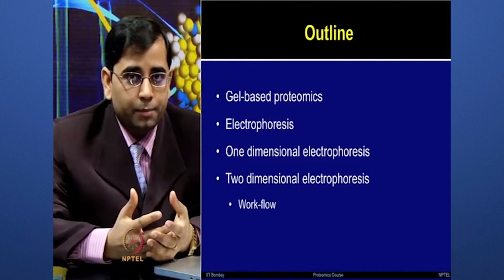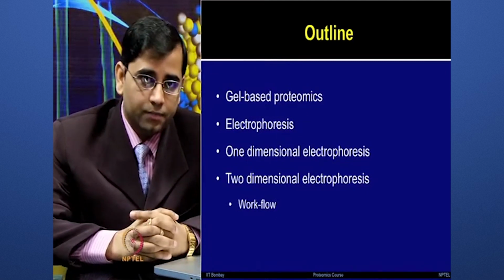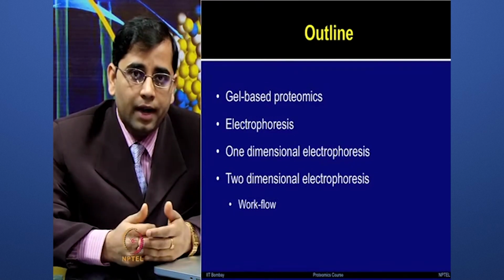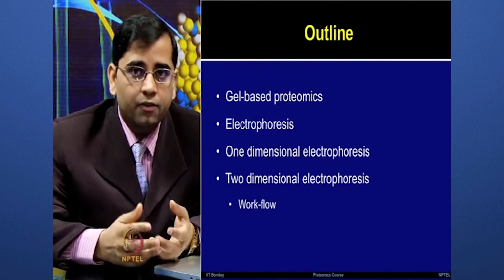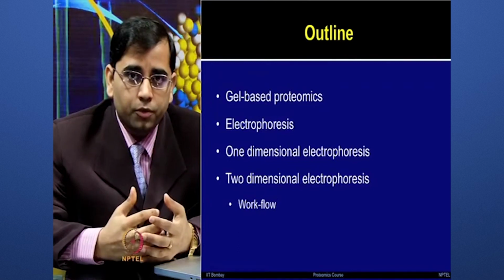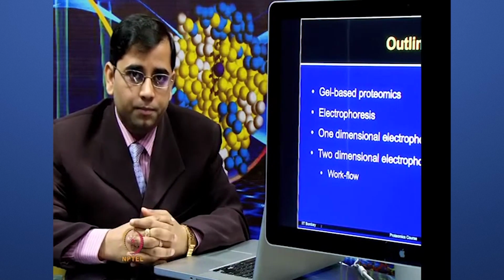But when you have a very complex mixture and you want to separate proteins based on two properties, then you can use two-dimensional electrophoresis. I will then describe the workflow of two-dimensional electrophoresis. There are different steps involved and we will walk you through all the steps. Also, during the process, I will show you some animations to clarify your concepts and some laboratory demonstrations to give you the real feel of the laboratory work being carried out for performing two-dimensional electrophoresis.